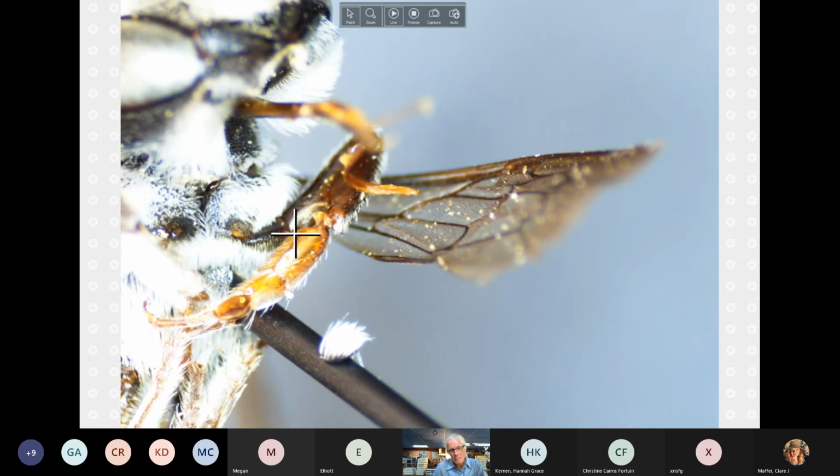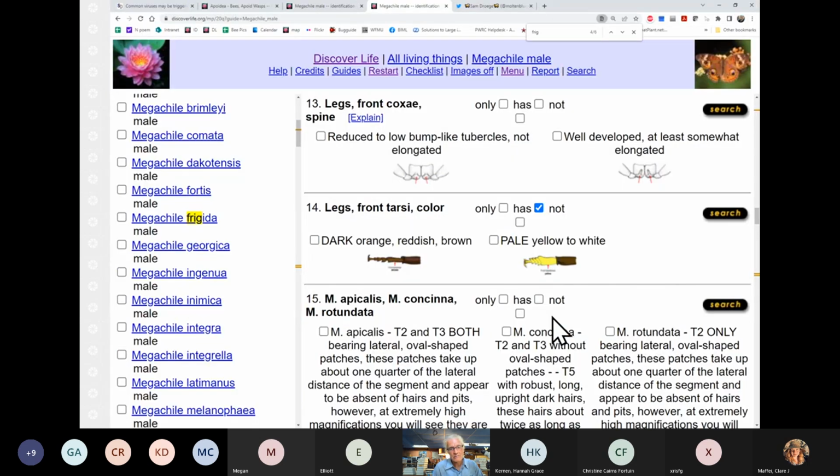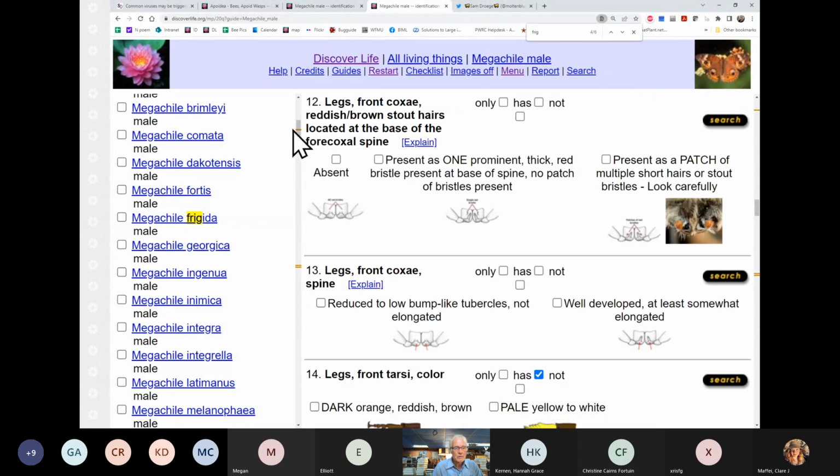This is the back side, and one of the features is that they're relatively wide compared to its counterpart, named Campanuli, which I think is all dark. I think this needs to be scored for being pale. This is the back side, and the upper side is the other way. But in my mind, when looking at it, I'm not using the guides, because that's one that is common enough. So, all right, I will score it for both.